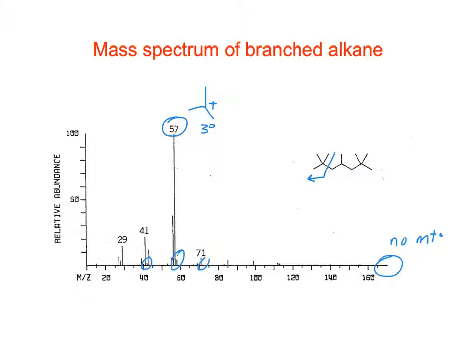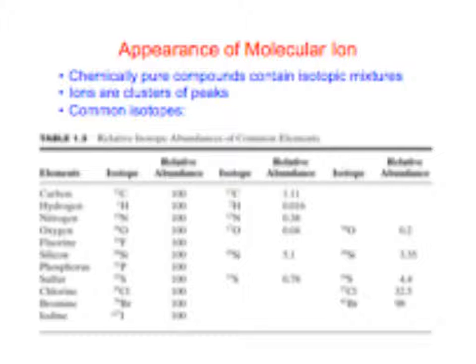And usually what we're interested in are the ions that are just slightly at a higher mass than the big ion, and these come from isotopes. Because in this method, we're separating them by unit masses. If we have an isotope that has +1, then we'll see that ion as well.